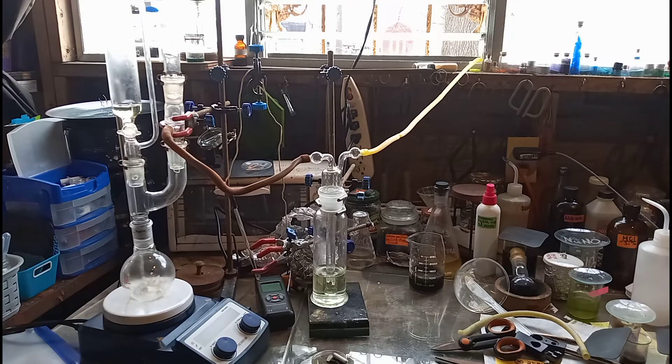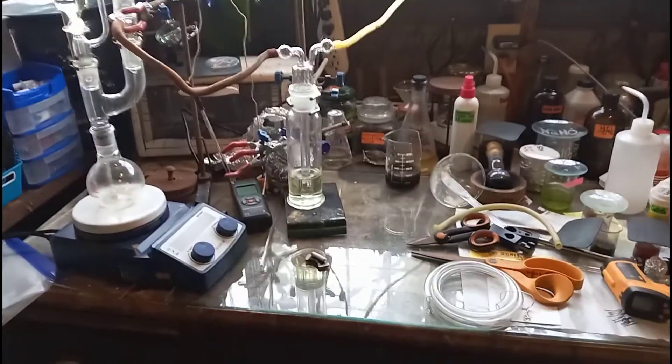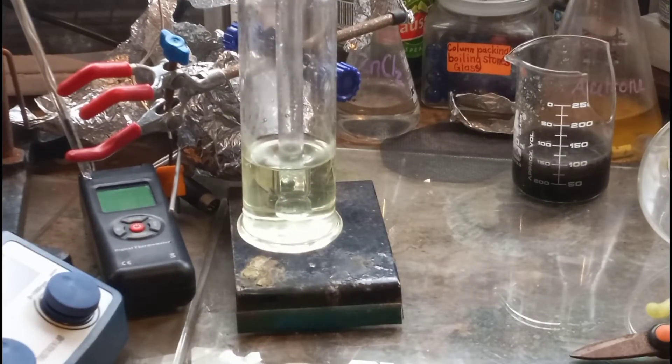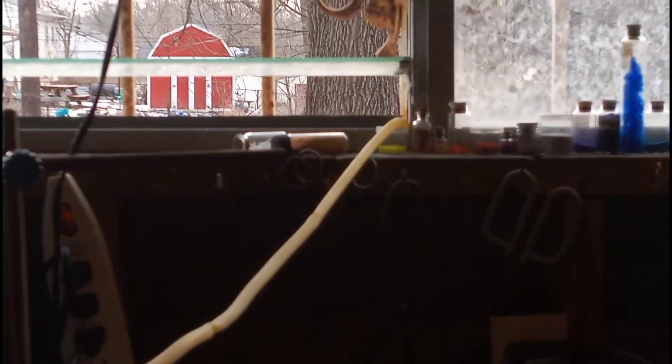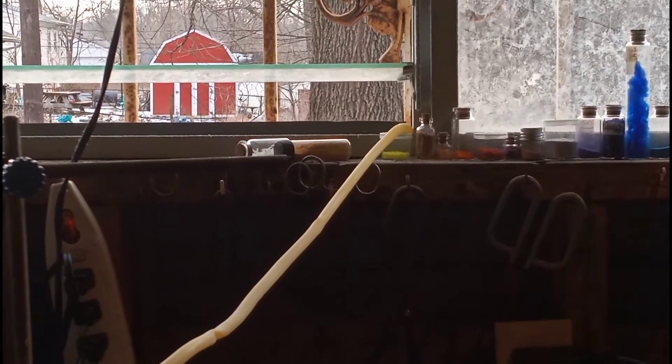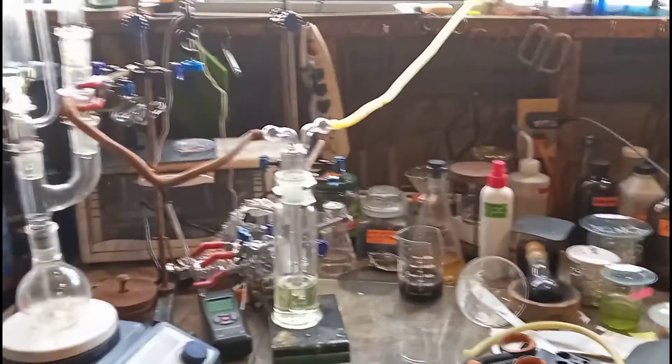Alright, so now the setup's complete. You can see what it looks like — I've got my gas output going into my wash bottle. There's a solution right there you can see in the wash bottle; it's a pale yellow color. That's got an arbitrary amount of potassium ferrocyanide trihydrate dissolved in it. And then from the gas wash bottle, you can see there is a line that I have running outside to output any excess chlorine gas that does not get used up in the reaction.